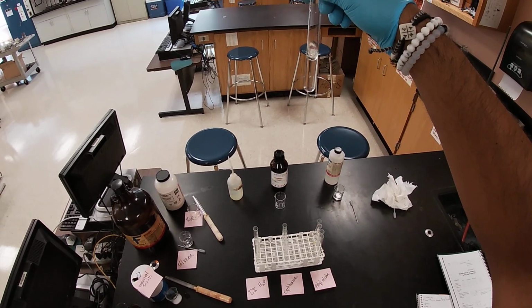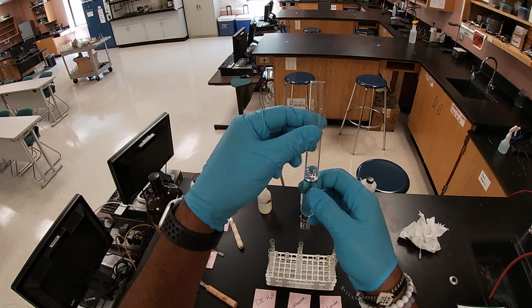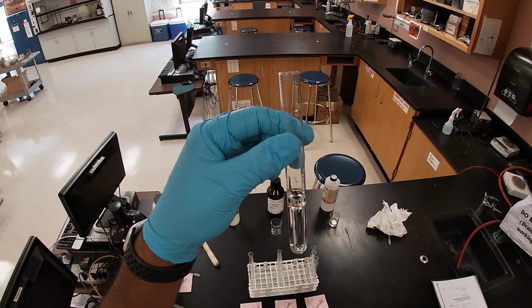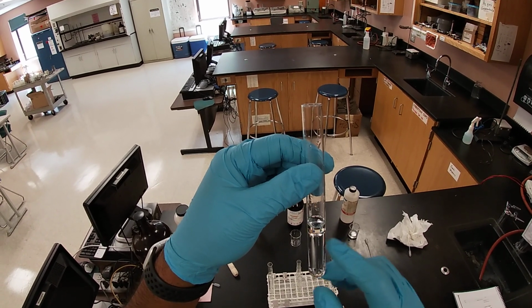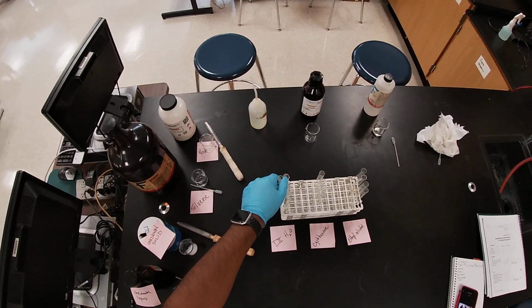Look, it wants to, but no, it doesn't want to. Okay, so there's a complete separation here, and so the top layer is going to be, in this case, toluene, and the bottom layer is going to be water. With this said, the bottom part, in this case water, would be more dense because it's in the lower part than the toluene. Toluene would be less dense.